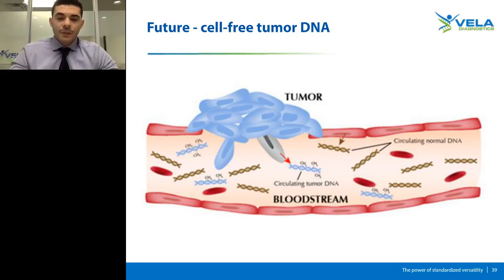Okay, so I think we touched on it a little bit with the presentation. The viral genome is much less complicated to some degree versus the actual human genome itself. But what's less complicated about it complicates it even more, if that makes any sense. The genetic variation from strain to strain makes it much more difficult to actually sequence and perform an alignment and variant calling on it.